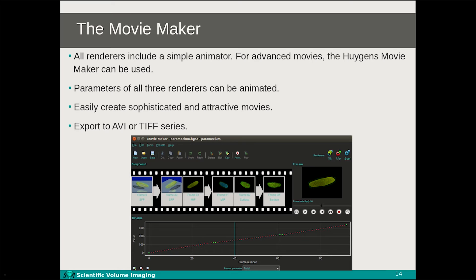In all the renderer tools, simple animations can be created directly in the tool itself by setting the parameters for two keyframes and letting the tool interpolate all parameters between them while rendering. To make more advanced movies, the Huygens Movie Maker can be used. This tool allows you to use any number of keyframes and combine all renderers into a single movie. The keyframes end up in a storyboard, and in the timeline at the bottom you can monitor and tweak the progression of all render parameters. The movie can be rendered at a given quality level, resolution and frame rate, and exported as an AVI video file or as a series of TIFF files containing the individual frames.